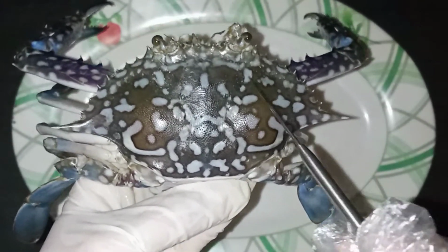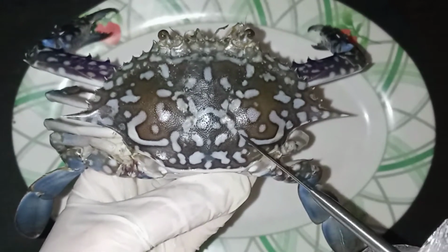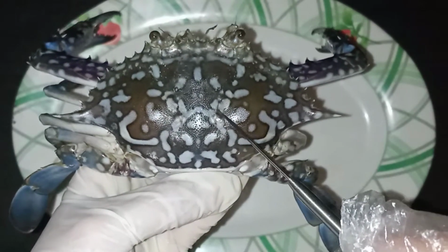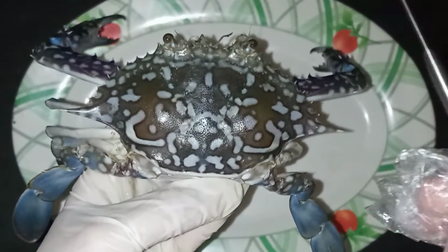The shell that covers the body and provides rigidity and protective covering is called the carapace. And on the middle part of the carapace, crabs also have a cervical groove.